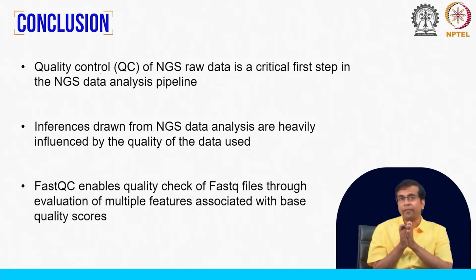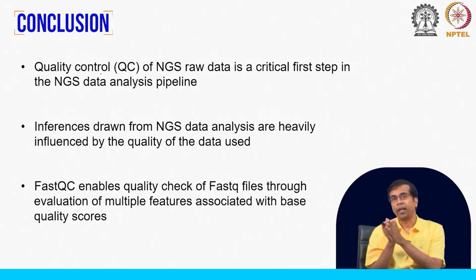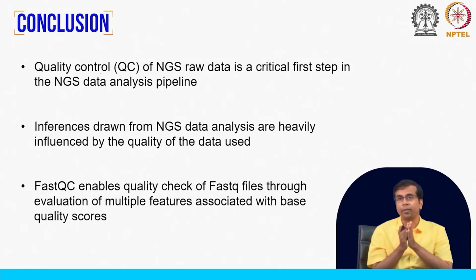Now, we have also seen that FastQC enables quality check of these FastQ files through evaluation of multiple features. In this class we talked about the features associated with only base quality scores. There are other types of quality checks that we will talk about, and FastQC reports those as well. Now, one of the questions we might have is what do we do once we have detected this bad quality?